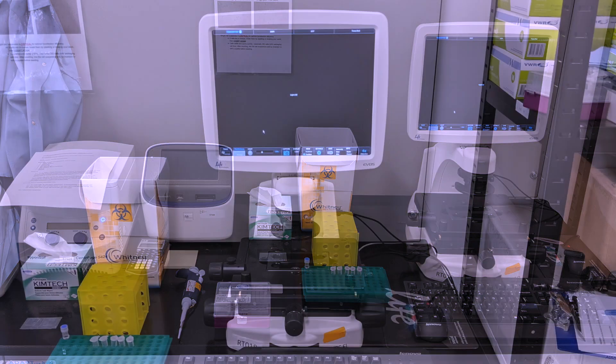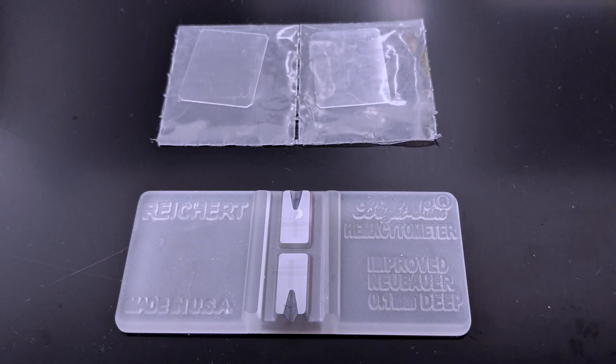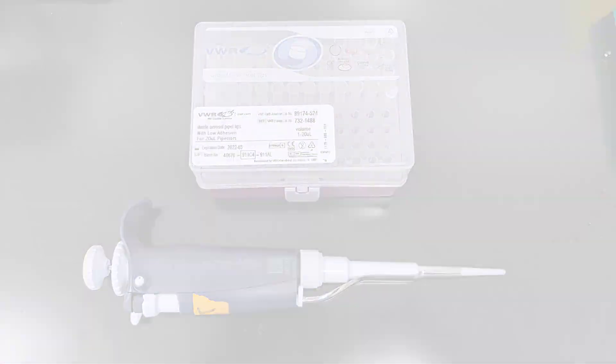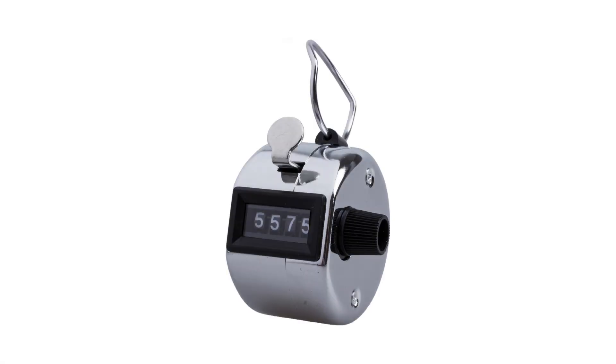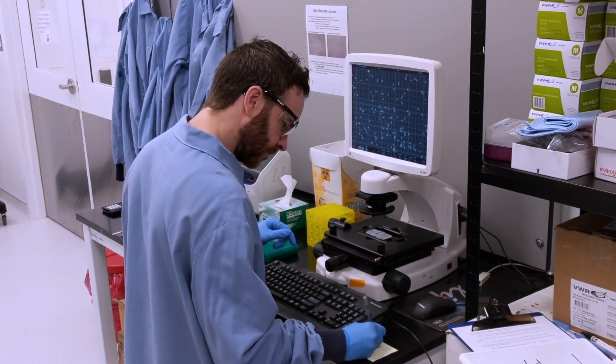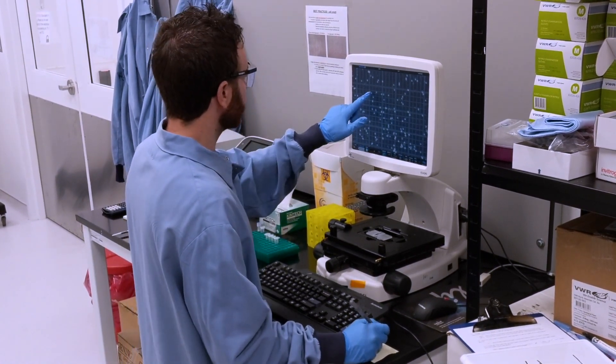To count cells, we will need a microscope, a hemocytometer, a micropipette with tips, and optionally, a cell counting device. If you don't have a cell counting device, you can simply keep track of your cell count with pen and paper.